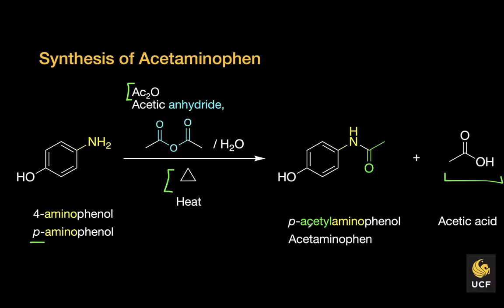You may also notice it called paracetamol, right? But anyways, acetaminophen is a common name.